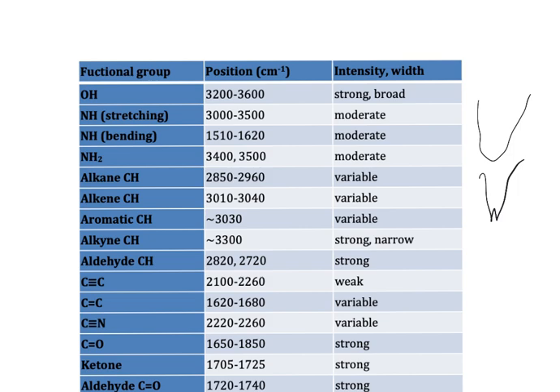So alkane is just another way of saying sp3, alkene is sp2, and aromatic is a certain type of sp2, like the benzene ring, but it's still sp2. And then alkyne is sp, and then we know aldehyde is that.